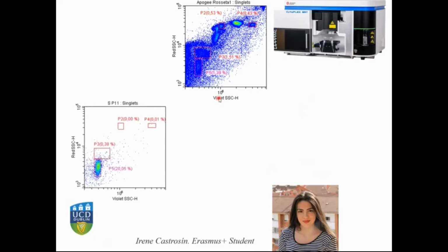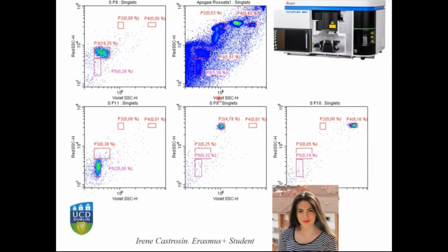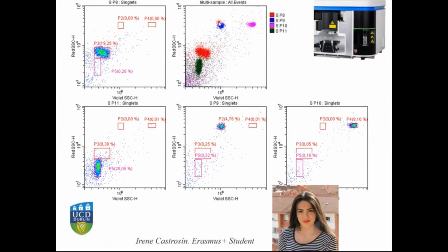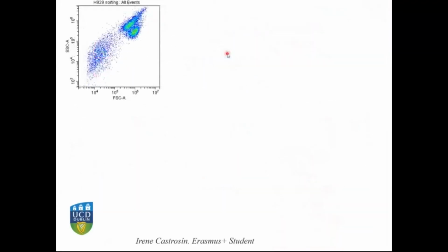So when we analyze each one of them after the sorting, you can see they are perfectly falling back into the same place. I really like this one, especially if we pay attention to this group here. This is the composition of all of them, but now here you can see this sorted group is clearly different than this one or any of these two. So clearly we can select these subpopulations that are around 200, 300 nanometer size and differentiate them based on their scatter characteristics. Nothing more than scatter.